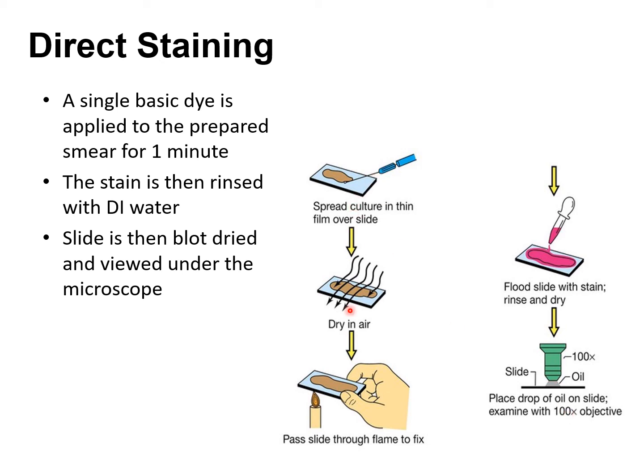Make sure that you know the steps of how to do a positive stain. Make sure you understand why we're doing each step, okay? Make sure to understand why a basic dye is going to stain the bacteria cell itself and not the background. Don't worry about memorizing whether you left that dye for a minute or less than a minute. I'm not going to ask you about the time, but you will need to know the steps, and why we're doing every single step.